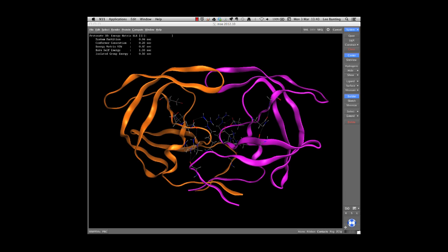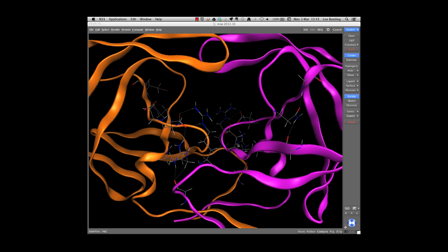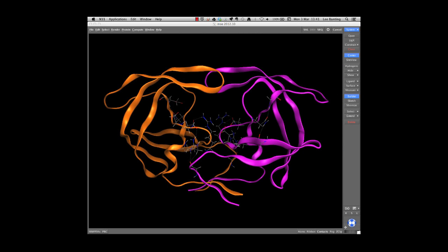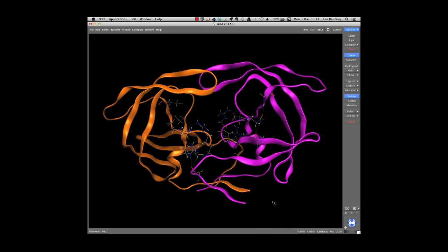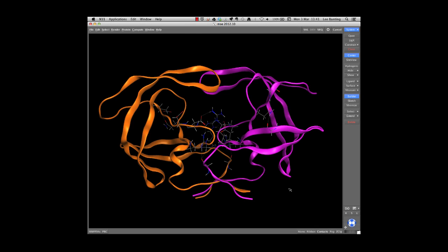So if I move this out of the way, hopefully, if you can see a recalculation in progress, you may just see protons moving around, but you don't, because this is quite a small protein. And that's done very quickly. Okay, so now our structure is ready for modelling.